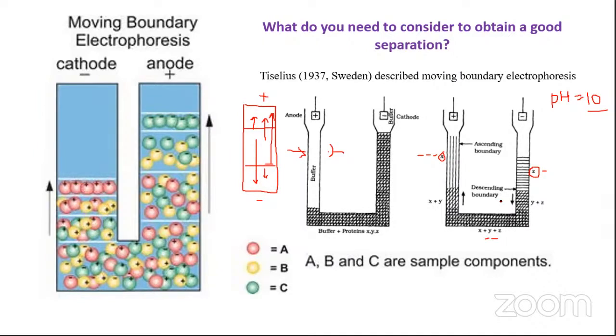So, is it in any way beneficial for a biologist to separate proteins and to place them in this big tube at such a large concentration? It is not beneficial, right? And it is actually because of this concentrated protein mixture that a great amount of friction is created during moving boundary electrophoretic separation. That leads to an increase in temperature, that leads to an increase in convection current.